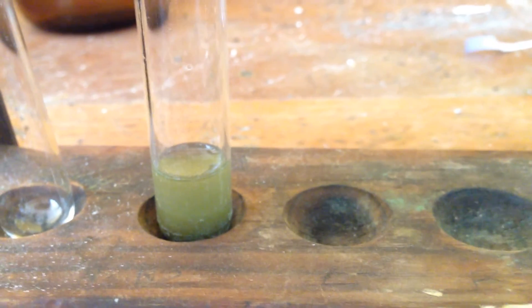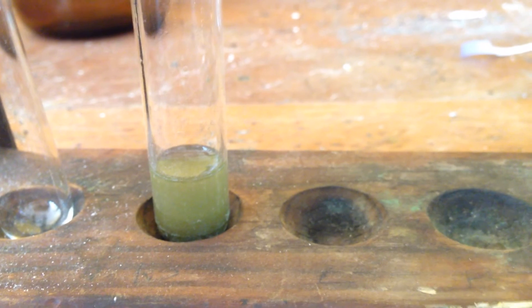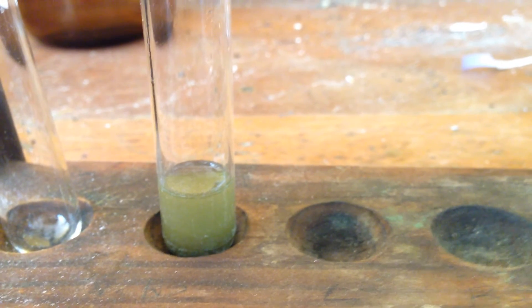You can see that it's got a horrible brown, dull, murky precipitate—not very nice at all. This is the test for an aldehyde using Fehling's solution.